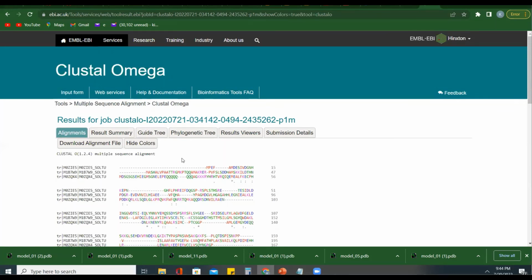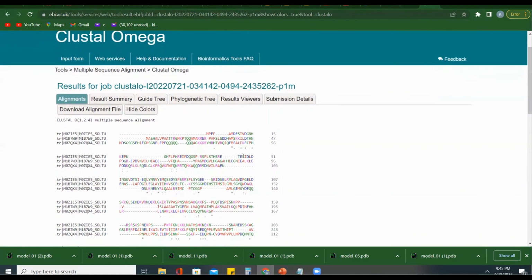You can get your sequence from NCBI, or the RCSB protein data bank, PDB. You can also get it from Swiss-Prot or UniProt, depending on wherever you have your sequence. And if your sequence is gotten from the lab, maybe after you sequence your sample and you have some polypeptide sequence, just copy that and put it straight into this software, and this software is going to tell you the alignment, the similarity, the percentage identity, and you can also get the phylogenetic tree result for your multi-sequence.